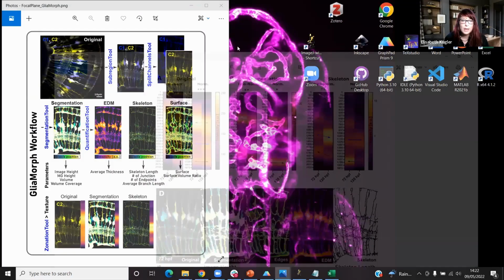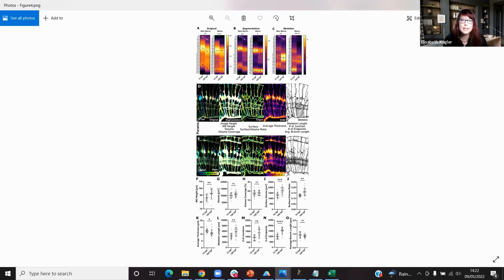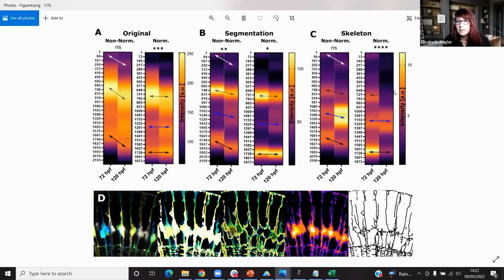So basically at this point, we understand what happens with our data. And for this, we can now come back to this zonation tool, where we can start to make sense of what it actually means to plot these data from 3D into a 1D vector, and when it actually makes sense to look at the data like this. So quite at the start, when we talked about this zonation tool, we talked about normalization so that we could stretch the images to be the same size. And I just want to very briefly talk about this.